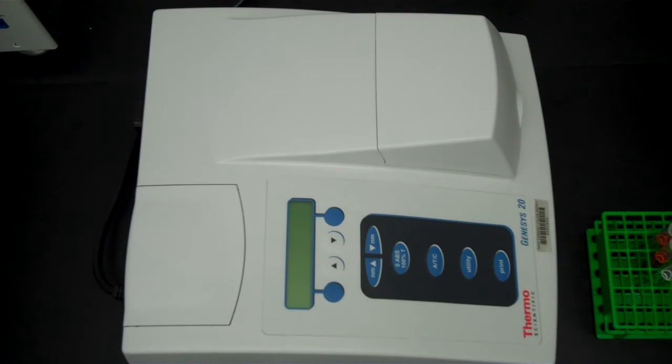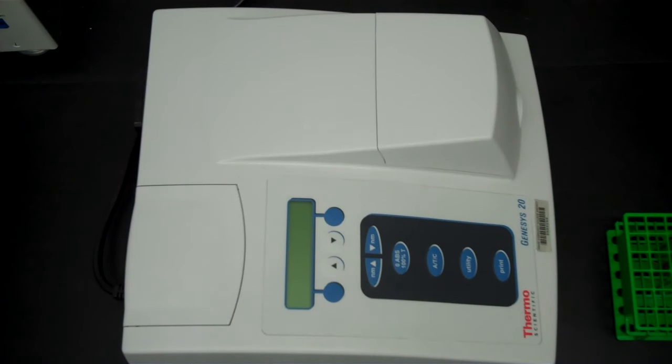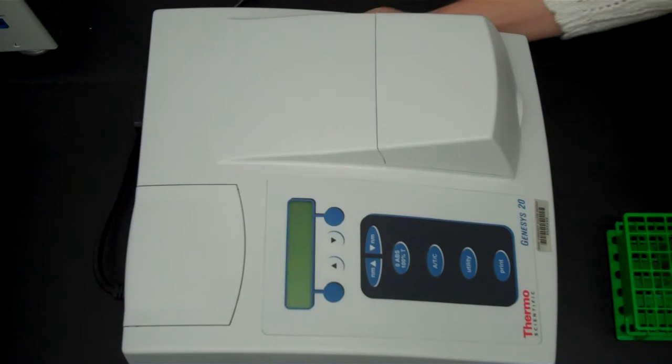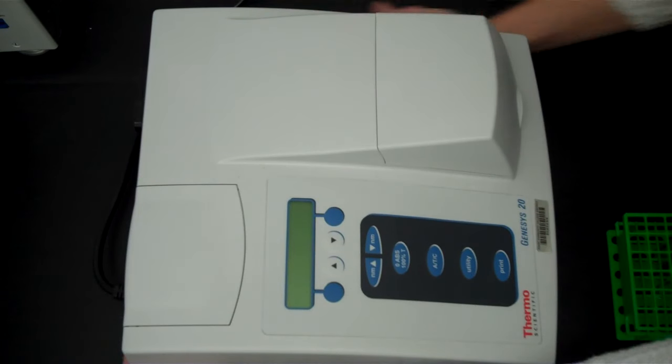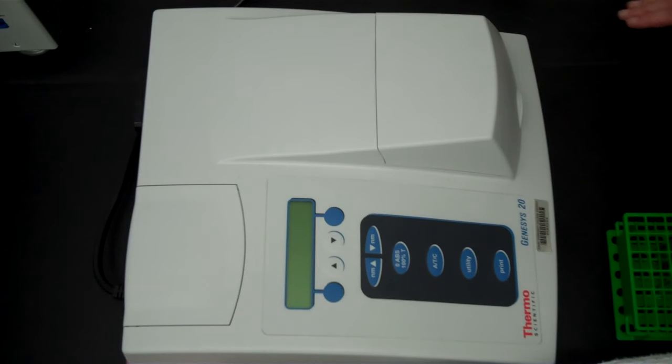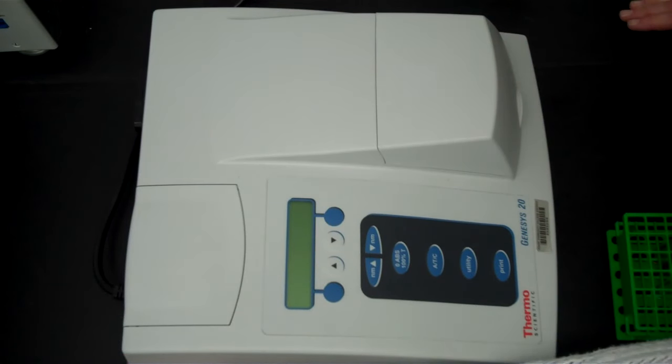When you first get your spectrophotometer you will need to remove the cover and then turn it on, and there's a dial in the lower left-hand corner.